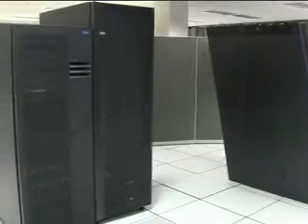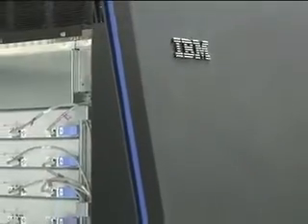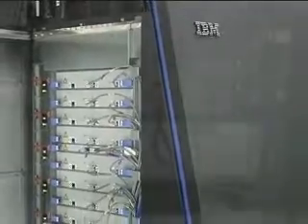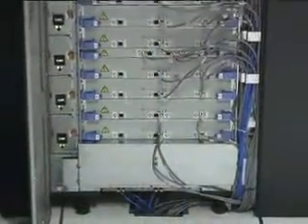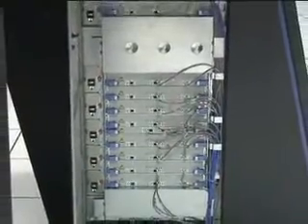A big part of that infrastructure lies in computation that can analyze these massive data sets as fast as the atom probe can produce them. In 2006, Iowa State acquired an IBM Blue Gene L computer, at the time one of the 10 most powerful supercomputers in U.S. academic institutions. With 2,048 processors and 11 trillion bytes of data storage, the teraflop system is capable of performing up to 5.7 trillion calculations per second.